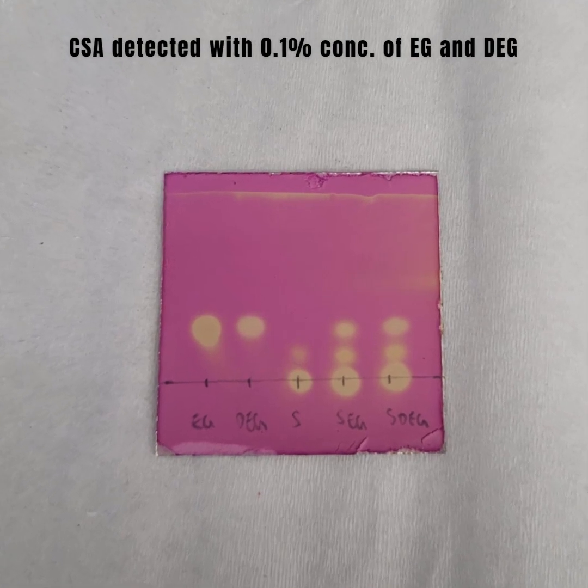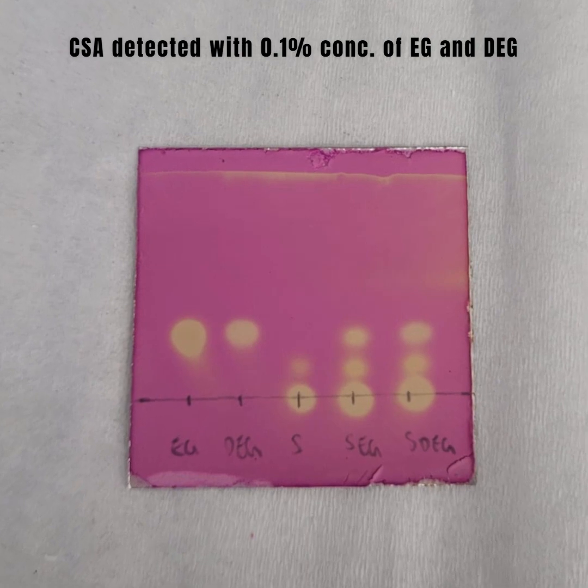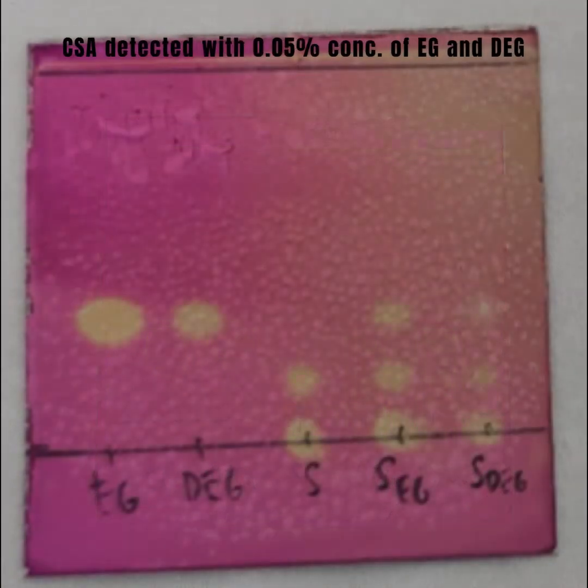In the example shown here, spots of pure ethylene glycol or diethylene glycol appear on the TLC plate at about the same distance from the baseline. The unspiked cough syrup shows 2 spots, but the spiked cough syrup samples clearly indicate the presence of ethylene glycol or diethylene glycol. This is an extremely sensitive detection tool and also works on samples that are spiked with as low as 0.05% of ethylene or diethylene glycol.